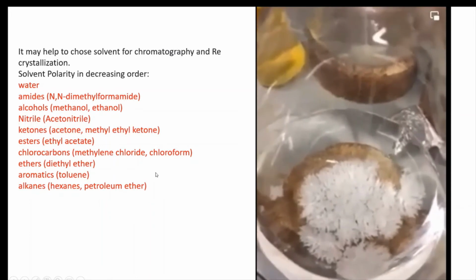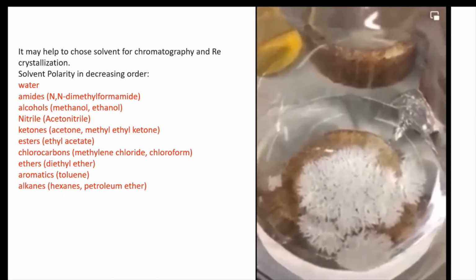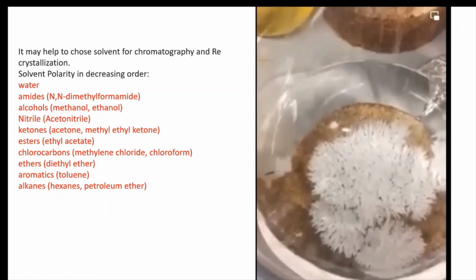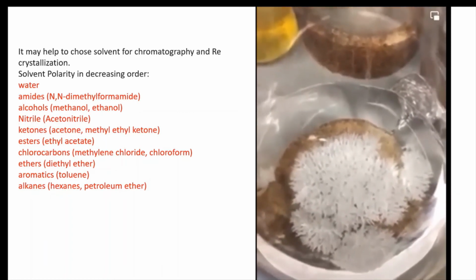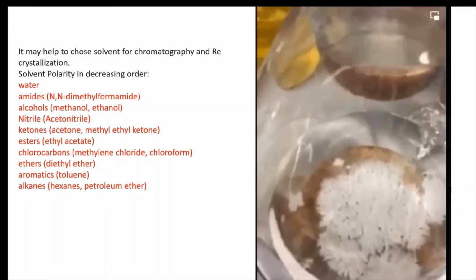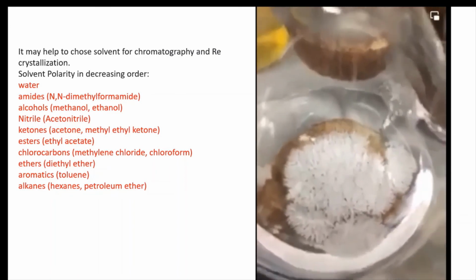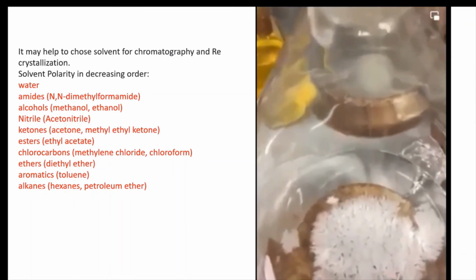There are some other things you can consider for the recrystallization or purification of your compound. Suppose you did a reaction with NBS for bromination of aromatic rings or polyaromatic hydrocarbons, and after the reaction you might get the residue succinimide, where the bromine is used up but the impurity is succinimide or unused NBS. In that case, first check the TLC of your crude sample.